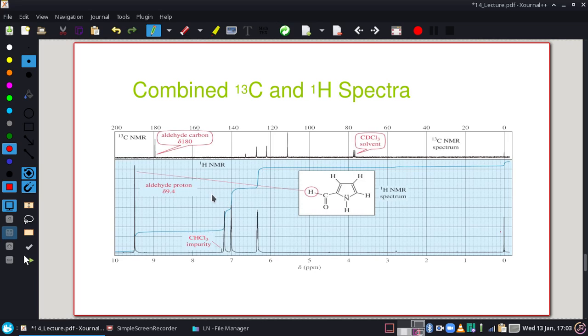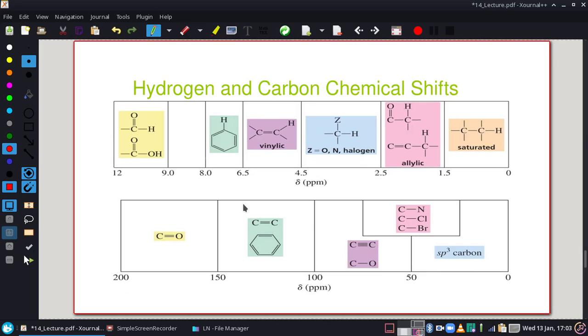So a typical carbon NMR, because it's so easy to do proton in that machine, what they typically do is, 90% of the time to actually get a decent carbon NMR, less than 10% of the time will give us a much, much, much better proton NMR. So we always see them together. Now, we shouldn't say that these peaks align up because where they show up on the carbon NMR is slightly different chemical shifts. So that's why I wanted this chart to show us.